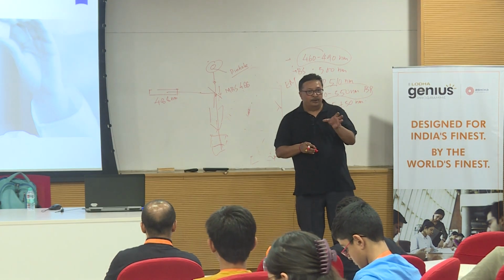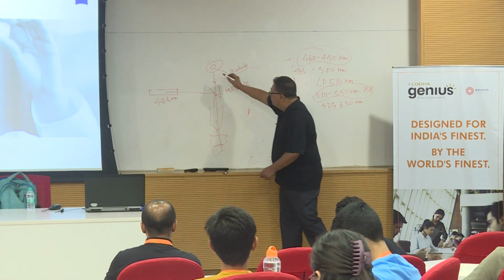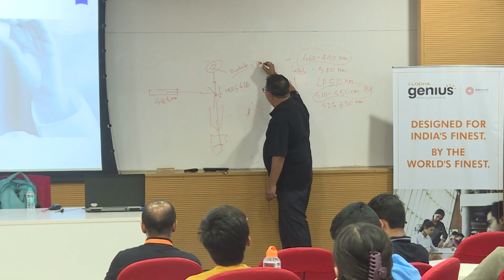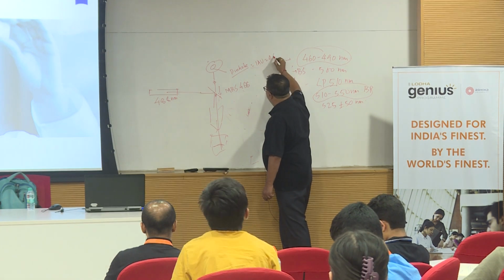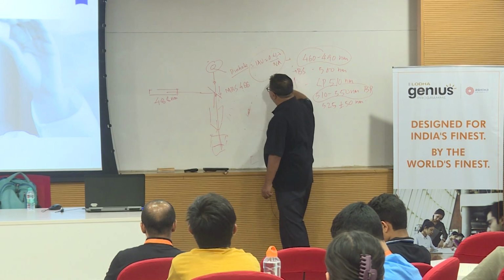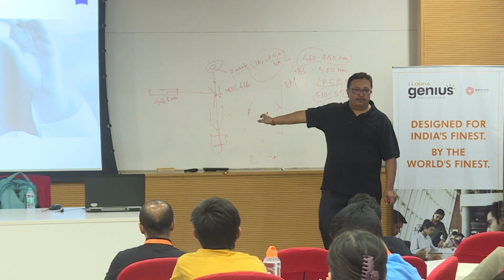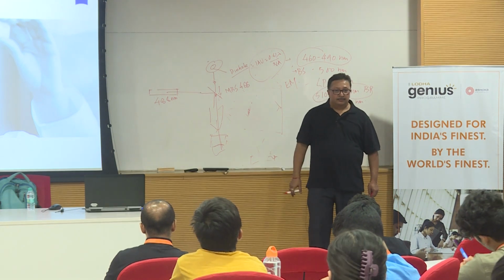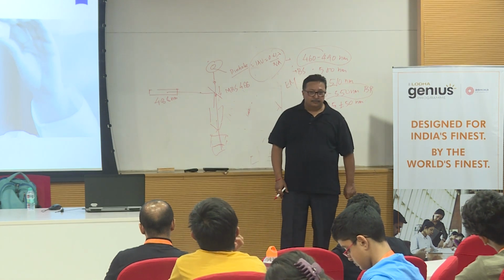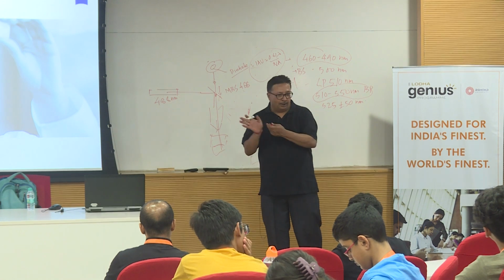And this is a variable pinhole. This pinhole is variable, governed by one formula called 1 AU or 1 Airy unit, 0.61 lambda by NA. Just remember this formula, everything else is easy. 0.61 lambda by NA. 0.61 is a fixed factor. What is lambda? Say the excitation wavelength, or excitation plus emission divided by 2, whichever you want to say.